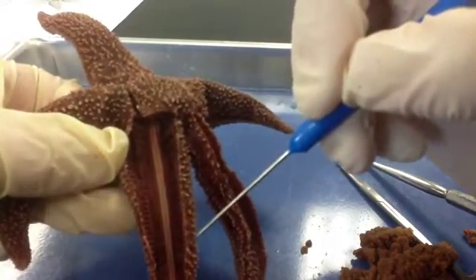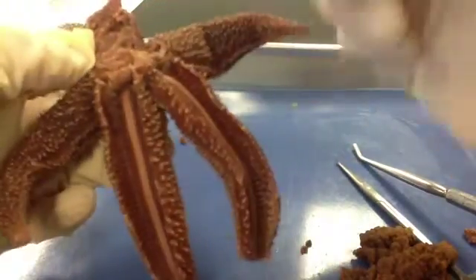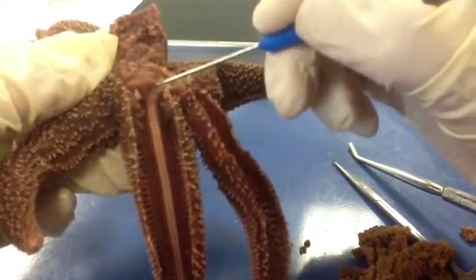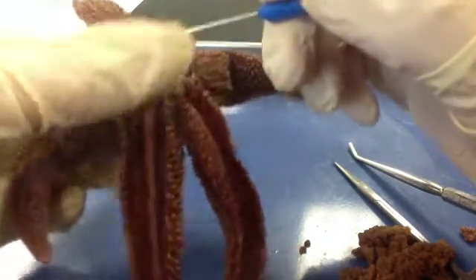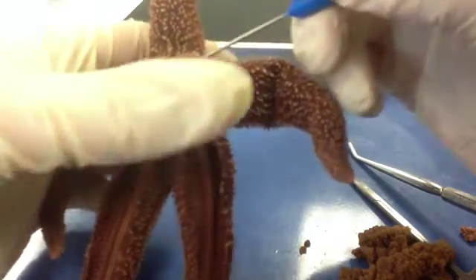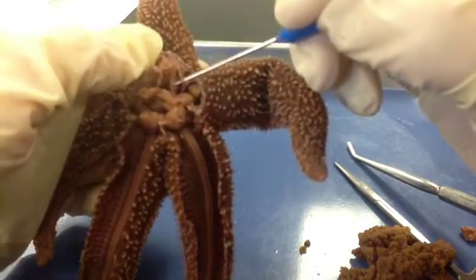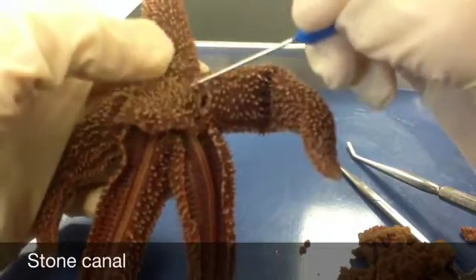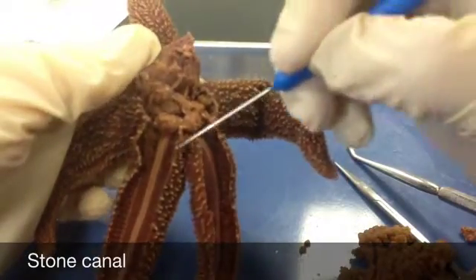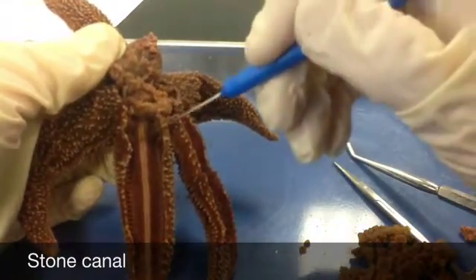Next, we're going to look at lateral canals that connect to a circular canal called the ring canal, up here in the central disc. If you find your madreporite and lift up, you can see another canal — a little tube — called the stone canal. Remember, the madreporite is part of the water vascular system: water enters here, travels down the stone canal, goes into the ring canal, and then flows down into lateral canals to which the tube feet are attached. That's it for the anatomy we'll be observing today.